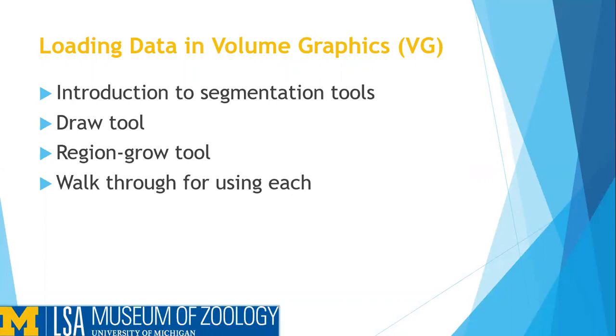Now, I do want to point out that Volume Graphics has a wide range of tools available for segmentation, but this video is only going to concentrate on our workflow at the University of Michigan. If you want a full in-depth view of all of the potential options you may need from Volume Graphics, please visit their website and consult their user manual.